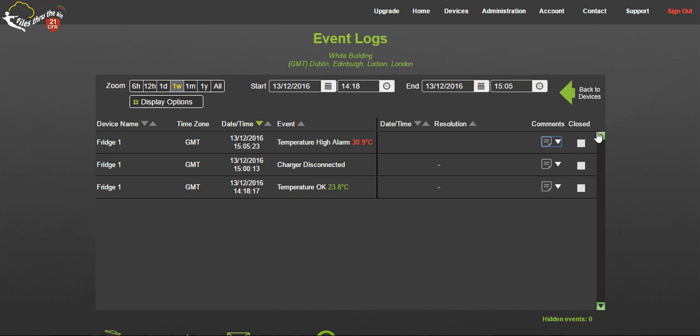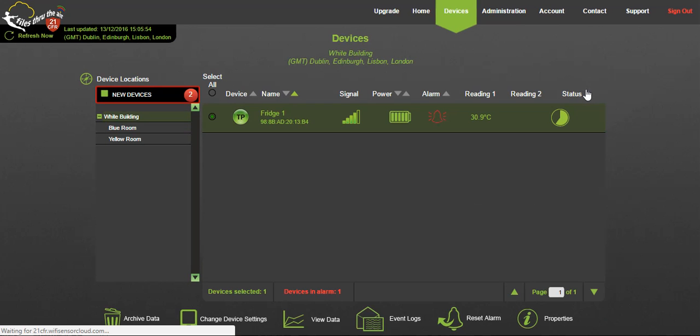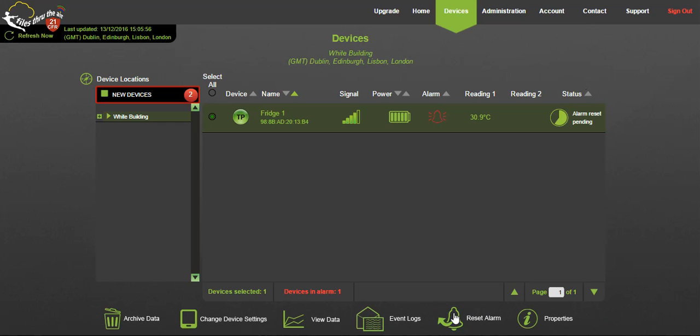To reset this alarm, go back to the dashboard and select reset alarm. This will reset the alarm at the next scheduled transmission on any logger currently in alarm condition.